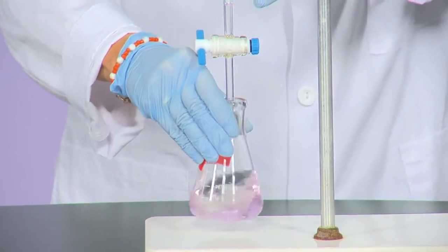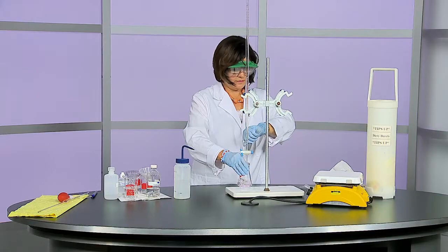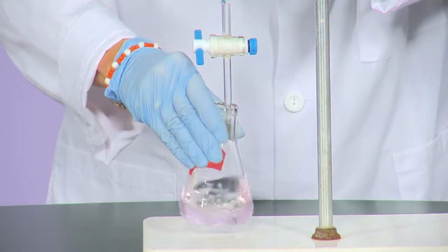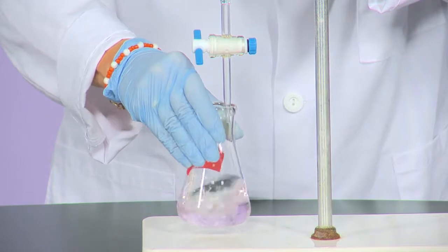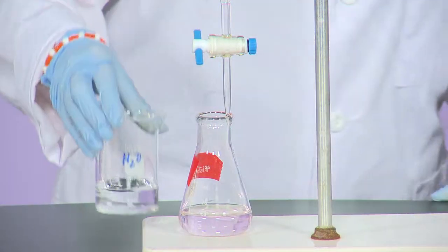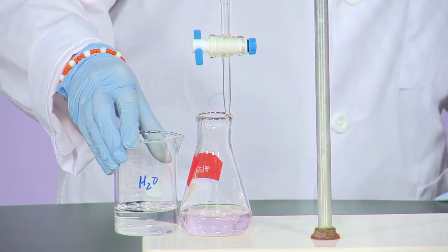The titration is complete once the pale pink color lasts for at least 15 seconds. Since the amount of analyte left near the end of the titration is small, allow enough time for the sodium hydroxide to find and react with the hydrochloric acid. 15 seconds should be enough stirring time. The goal is to have the palest pink possible that lasts for at least 15 seconds.